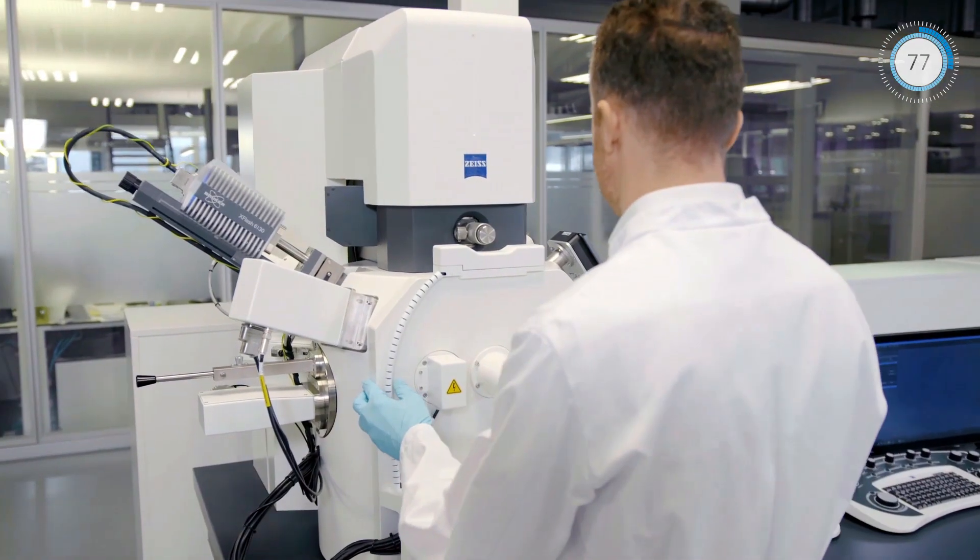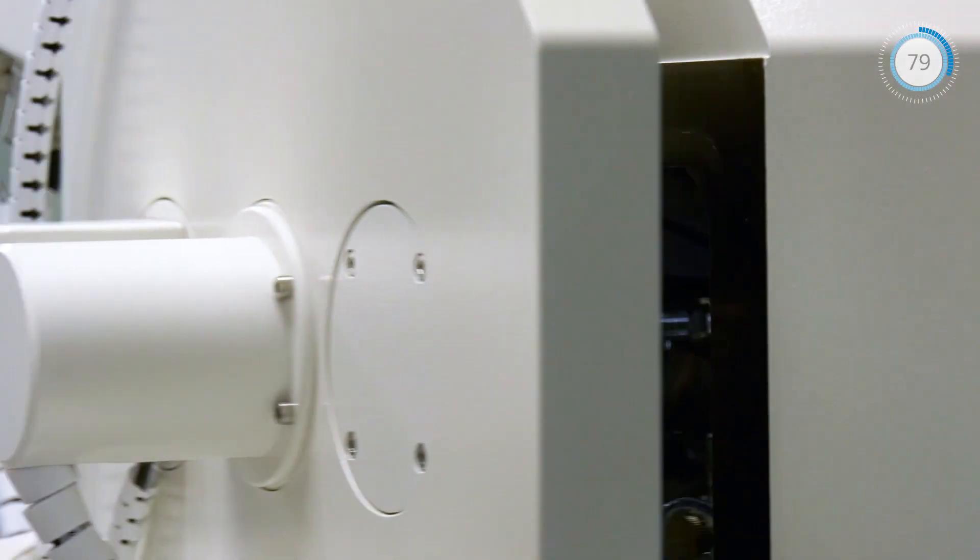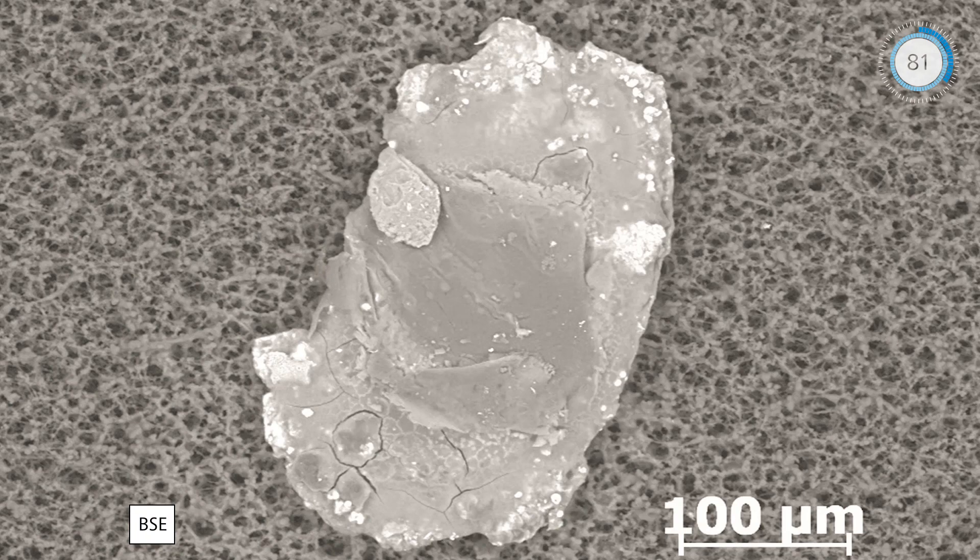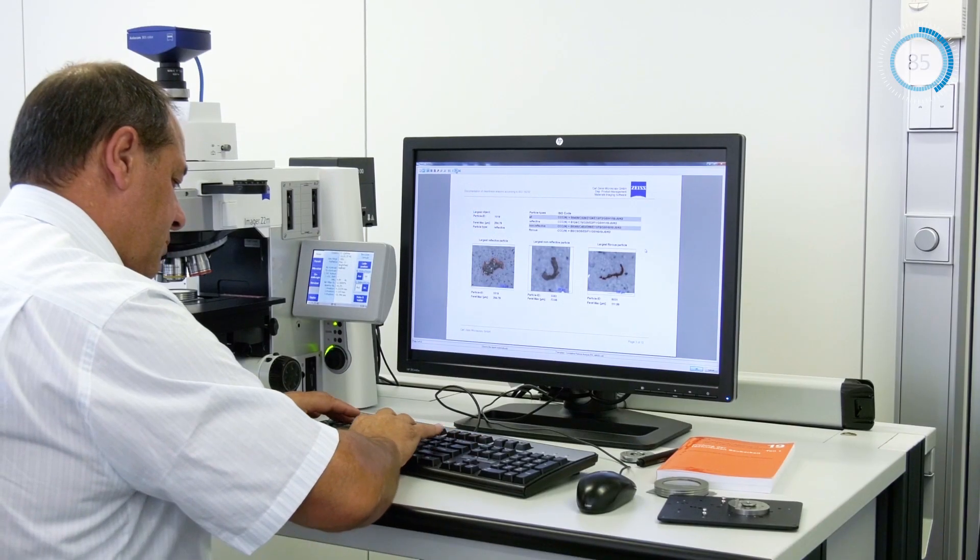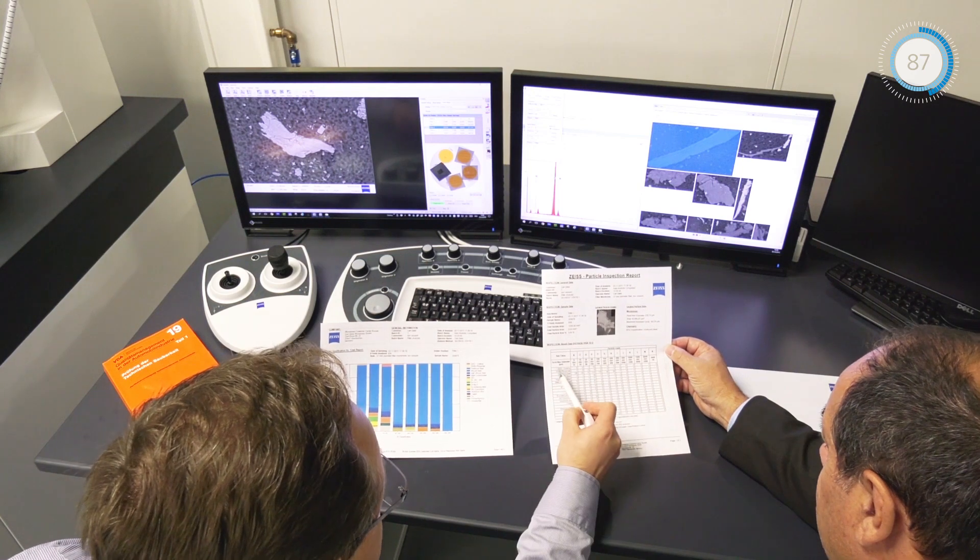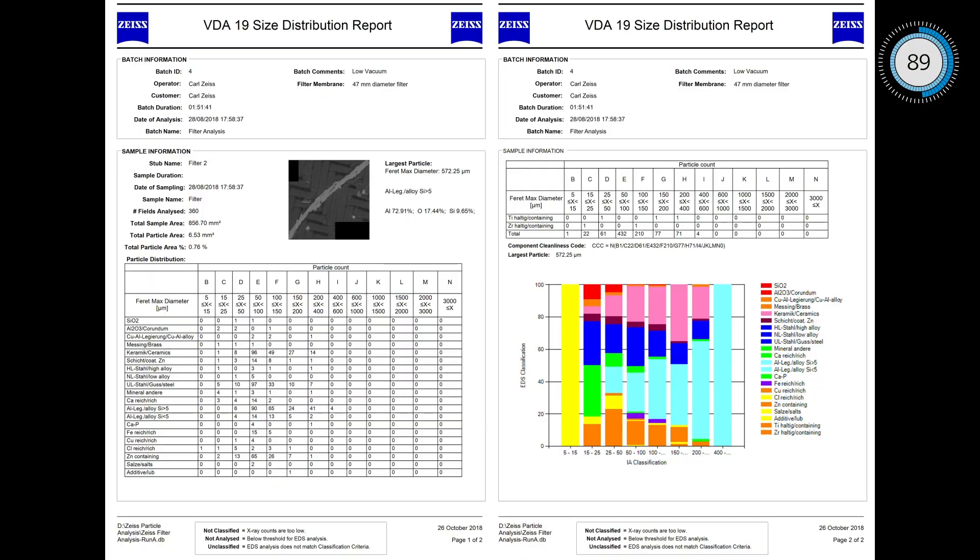Correlate particle data to elemental data for advanced characterization or classification workflows. Generate industry standard reports automatically with just the click of a button.